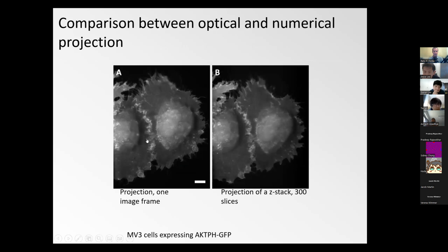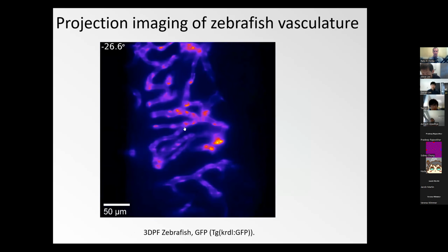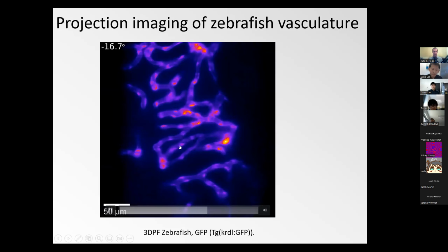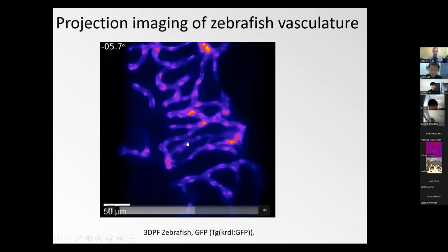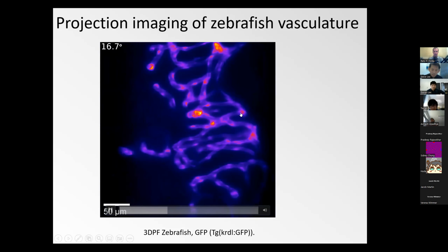Okay, here, this was one such analog projection in a single frame of cells. And here we actually acquired a stack and summed it together. And you may appreciate that the two views look quite similar. Again, this is some projection. If you have the real stack, you can also do a different projection, like maximum intensity projection, so they would look different. But if you do numerically the same thing, which is done here in an analog fashion, they look almost the same. And here is the vasculature in zebrafish, also done by this multi-angle projection technique. Every frame in that movie was a single camera exposure. And so we can essentially look around in the fish without acquiring a stack. These are just all single 2D images that are formed as analog projections of the sample.